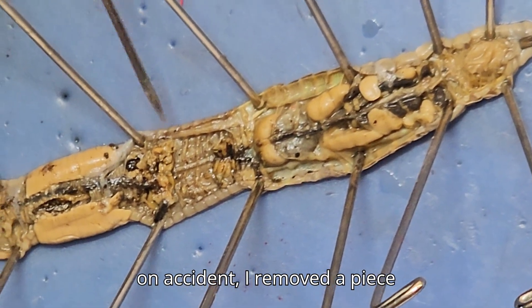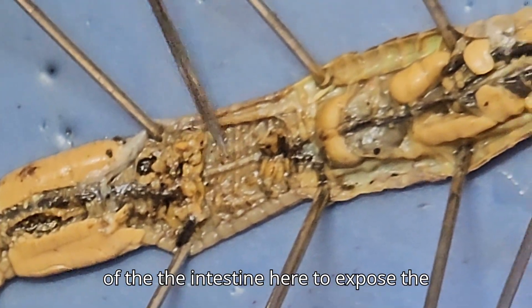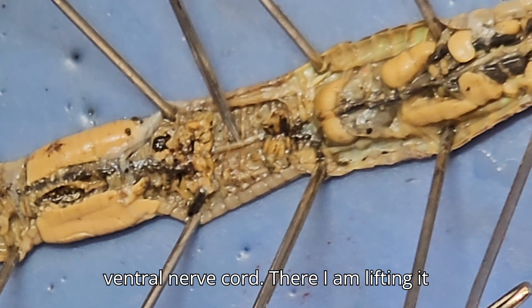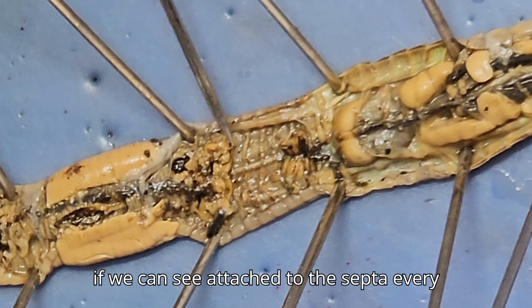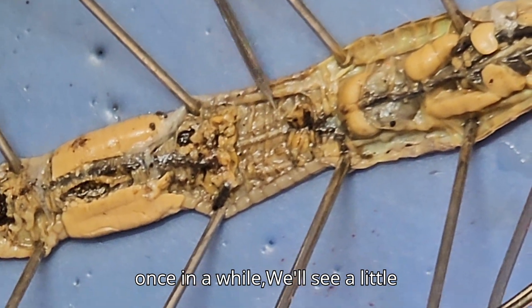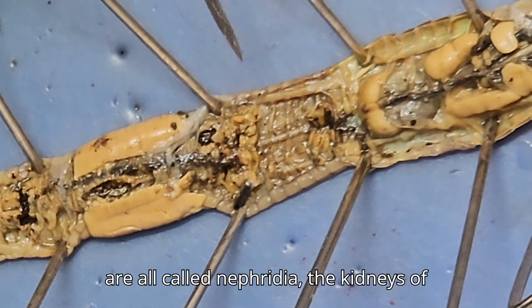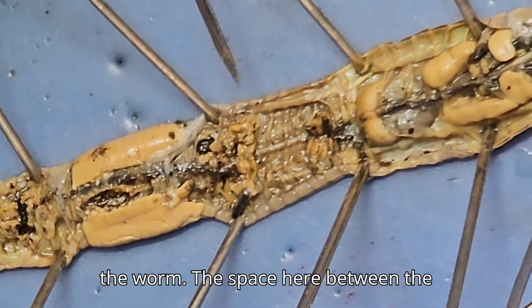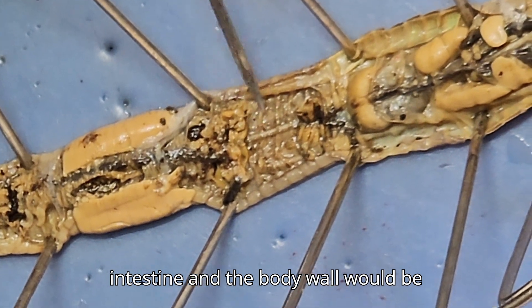I removed a piece of the intestine here to expose the ventral nerve cord — there, I'm lifting it up. Again, these lines are the septa. And if we look attached to the septa every once in a while, we'll see a little squiggly thing. Those little squiggly things are called nephridia, the kidneys of the worm. The space here between the intestine and the body wall would be called the coelom.